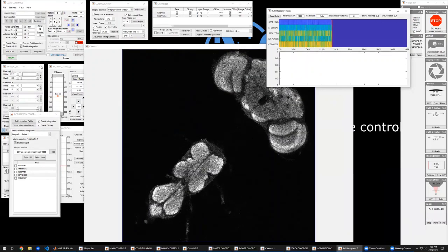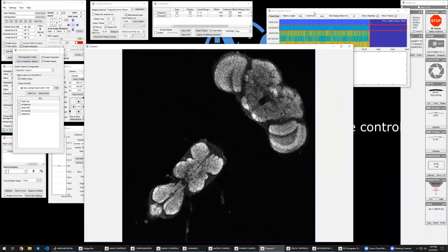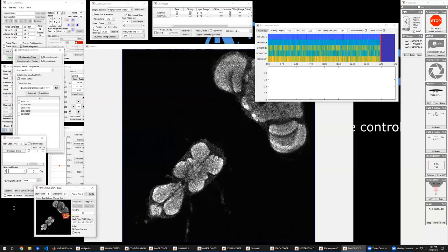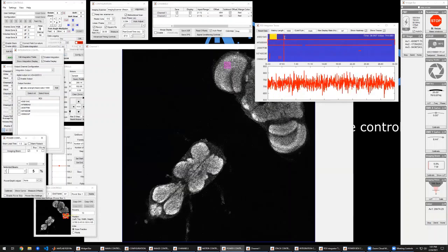I'm going to do a simple demo to show this display working. I'm going to use the power box feature to turn up power in one of these regions just to show that the display here will see that activity. So using the power box feature, I've just defined a small region here where I'm going to increase the power. So when I turn the power box on, you can see we're now showing some activity in that zone.